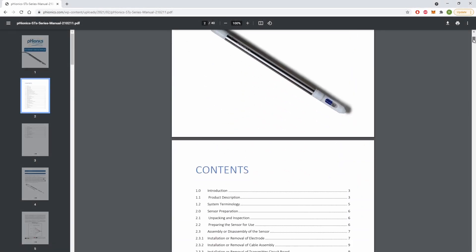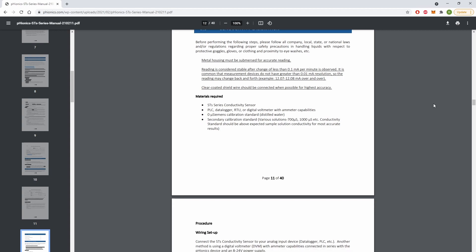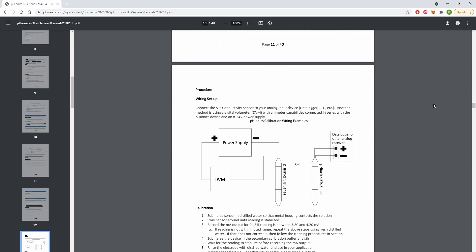Once the sensor is plugged in, simply calibrate by following along with the instructions in our manual and then you're ready to start measuring. The manual is linked in the video description below. That's all there is to it. For any questions or concerns, please reach out in the comment section below or via email at contact@bionics.com. Thank you so much for watching and I hope you have a great rest of your day.